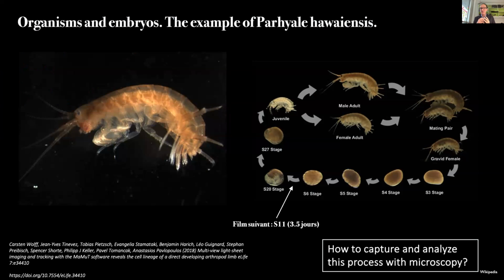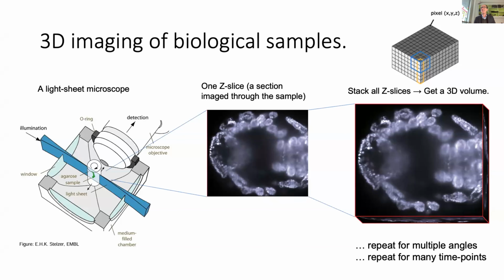There's a whole field in biology that's interested in developmental biology. How do you go from an egg to actually making something fully developed? And here you can image cells, you go to tissues, to organs, then you have a full organism. And learning how this is made is actually fascinating and also opens the gate to many cellular processes. Now, in that case, I guess you've noticed, we are not exactly 2D or flat organisms, right? The beauty of biology goes 3D. And you need to have some kind of imaging capability that can reproduce this 3D.